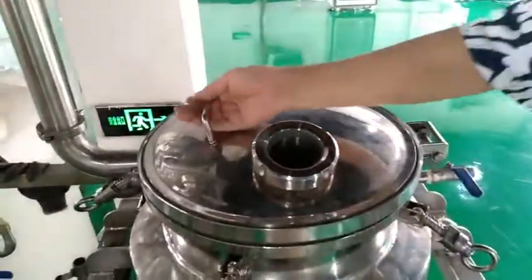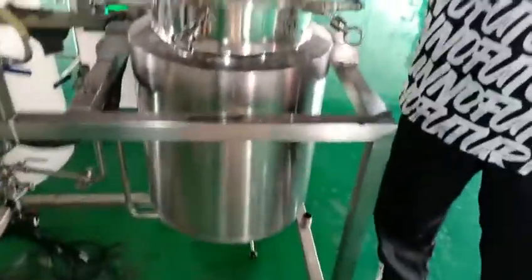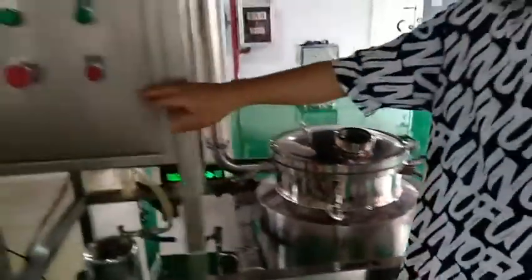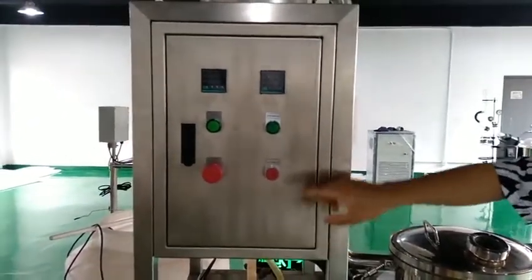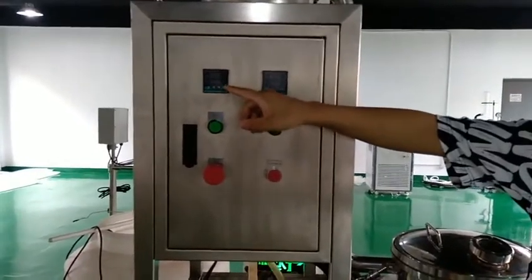This part is our extraction tank. You can put the raw material in this tank and close it. You can see this is our electric cabinet. You can set the temperature of the extraction tank on this meter.